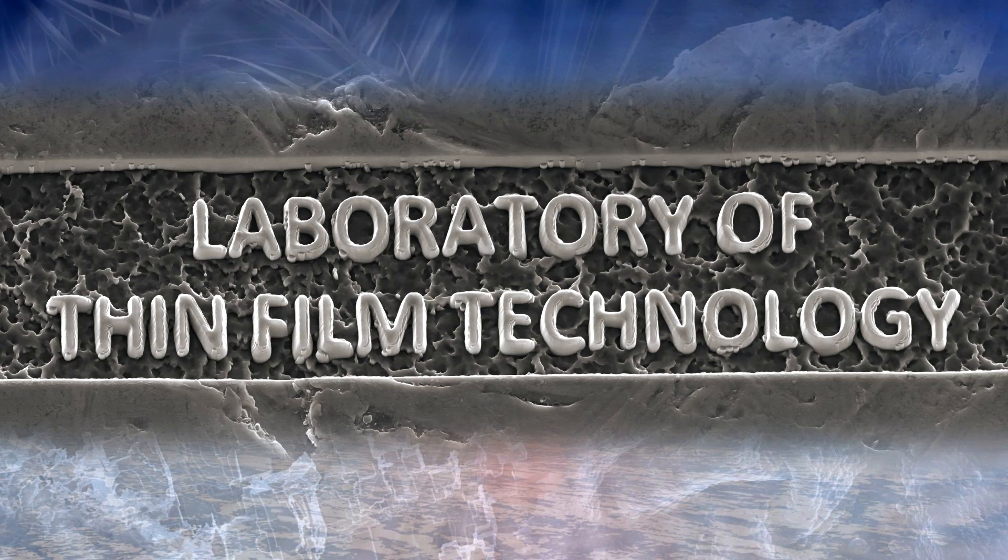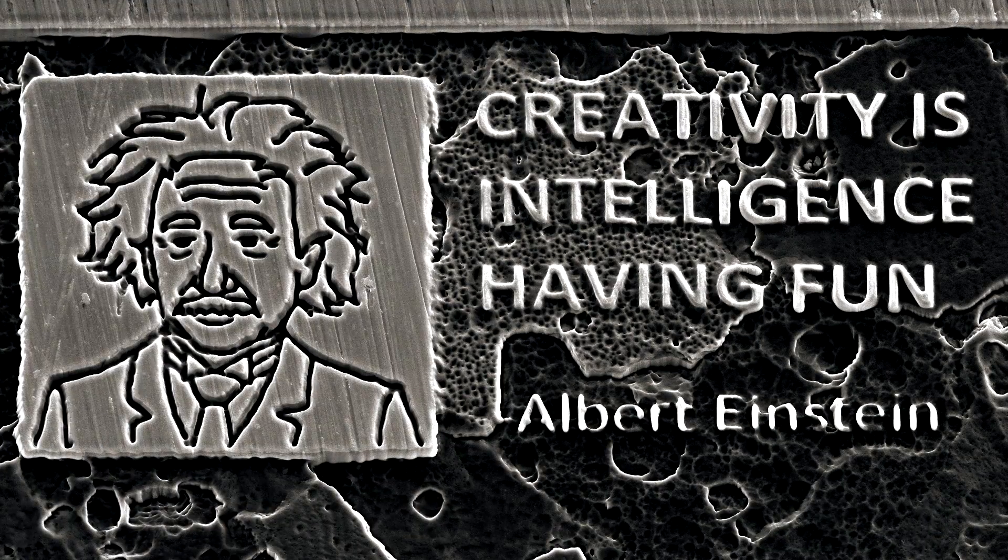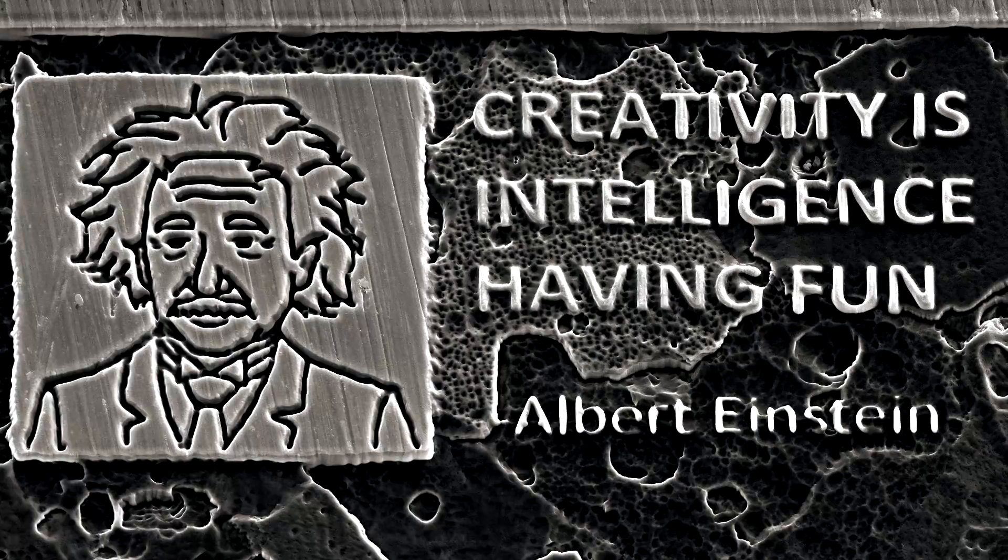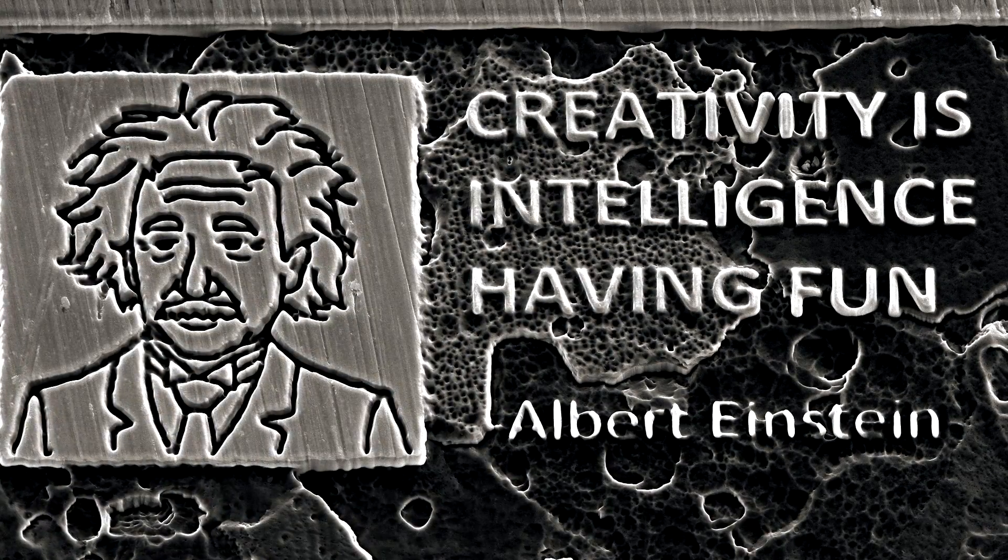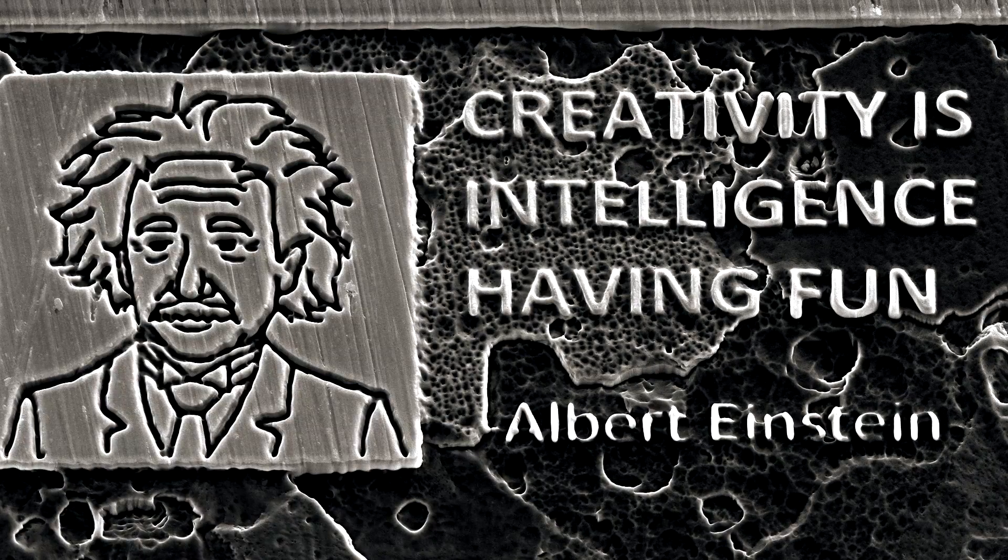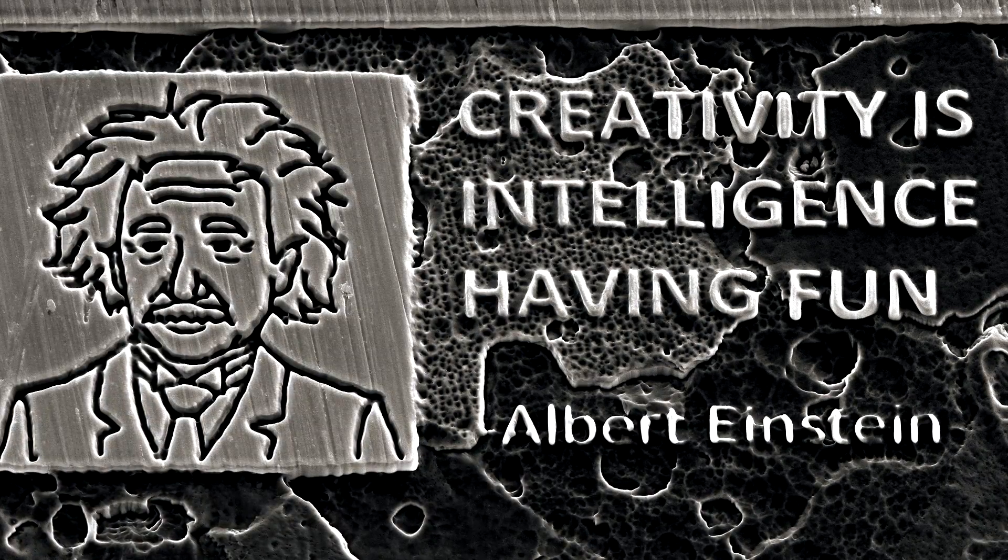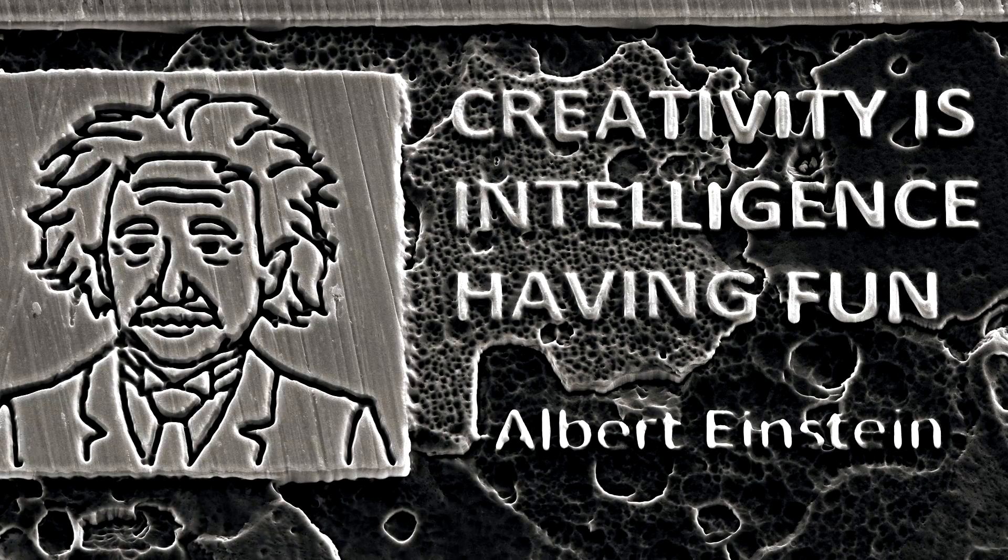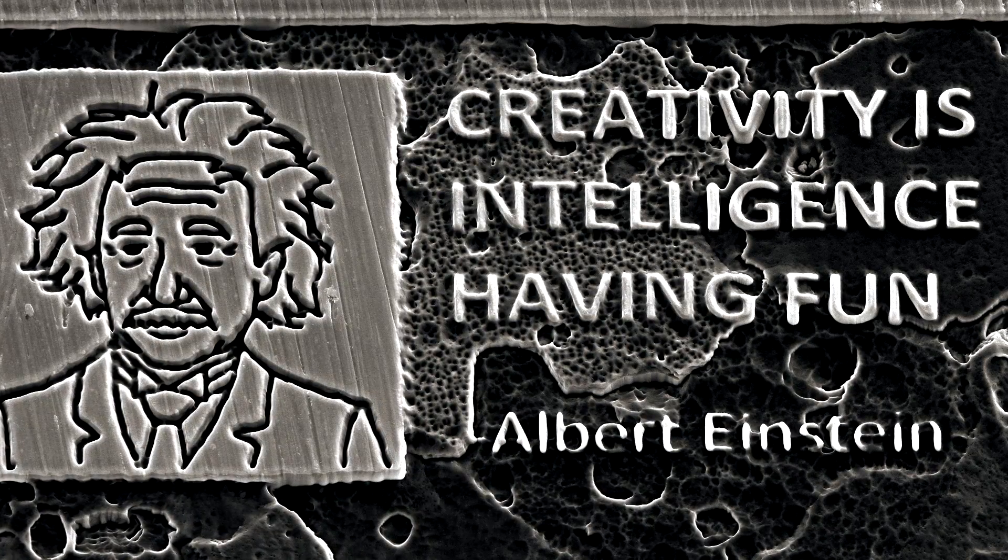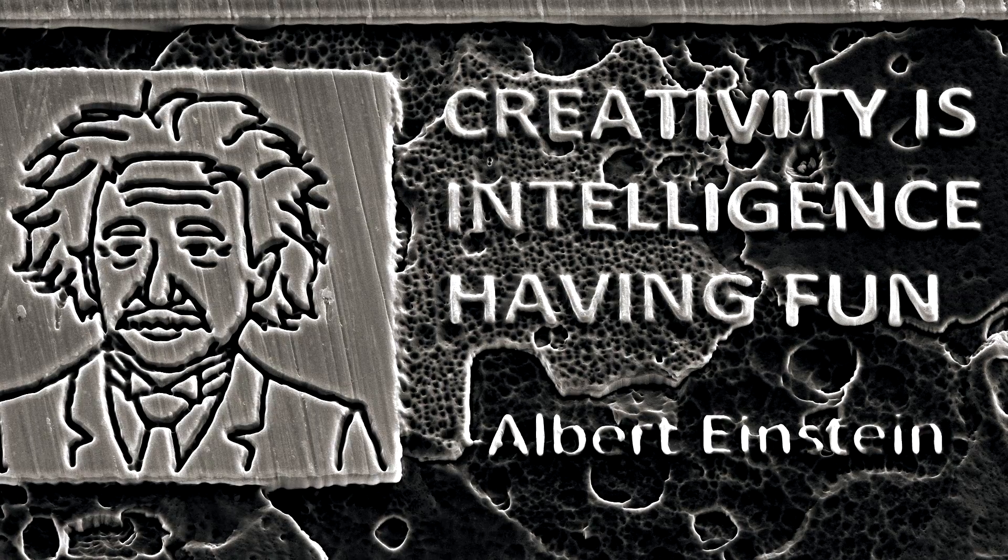It is also possible to create secret messages with the focused ion beam, by carving a desired text or schematics on a surface. These would be so small that they are invisible for the naked eye, and only readable by someone who has a scanning electron microscope and knows where to look.